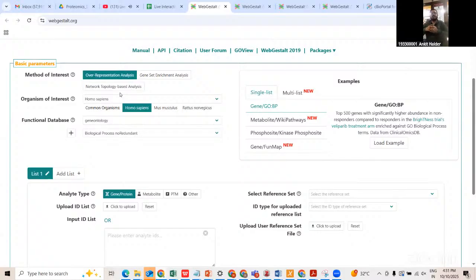That is the way to understand network-based analysis: how influential that particular protein is, or how much the spread is, whether it is a master or key regulator influencing a variety of important reactions or mechanisms, like ECM receptor, focal adhesion, or the EMT transitions. So how much influence does it have?